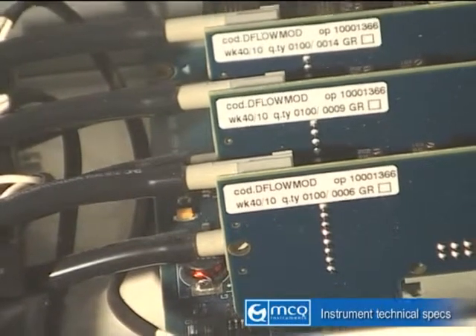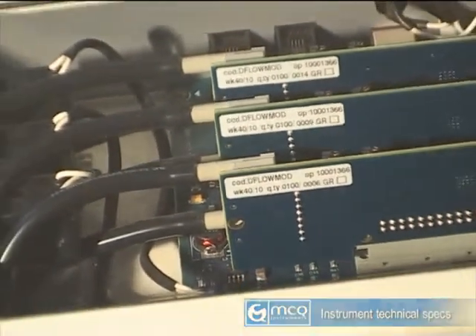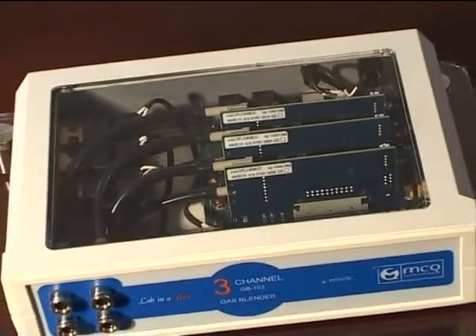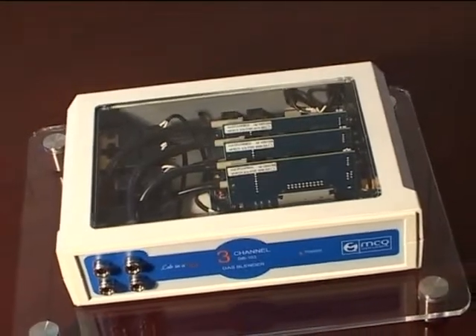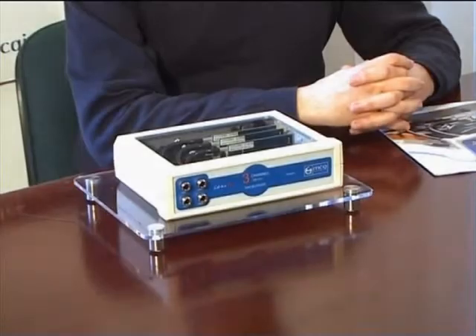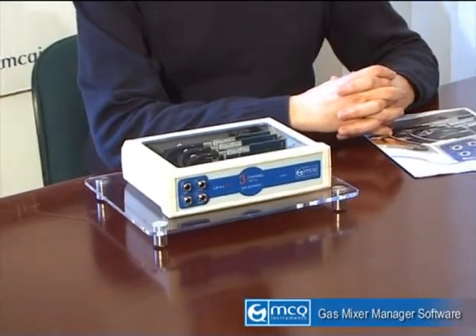Gas Blender 100 series is an instrument specifically engineered to create and manage dynamic three-gas mixtures, starting from non-aggressive pure gases. The instrument comes bundled with the Gas Mixer Manager, a software specifically designed to manage Gas Blender, which allows to easily and dynamically manage gas mixtures.